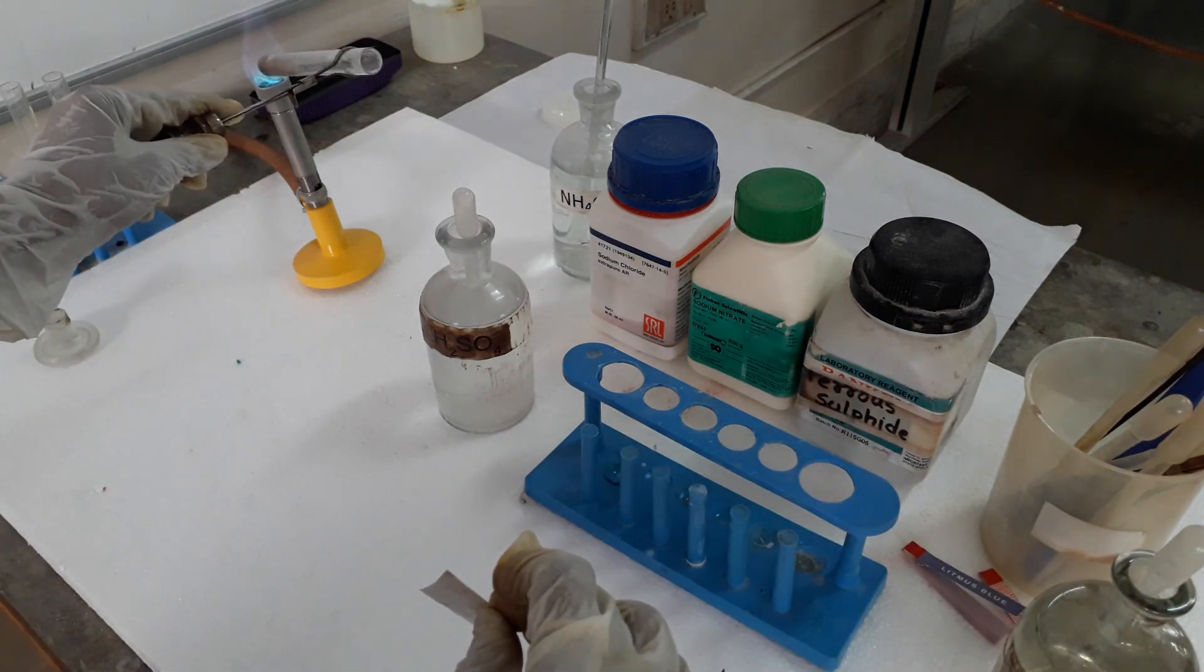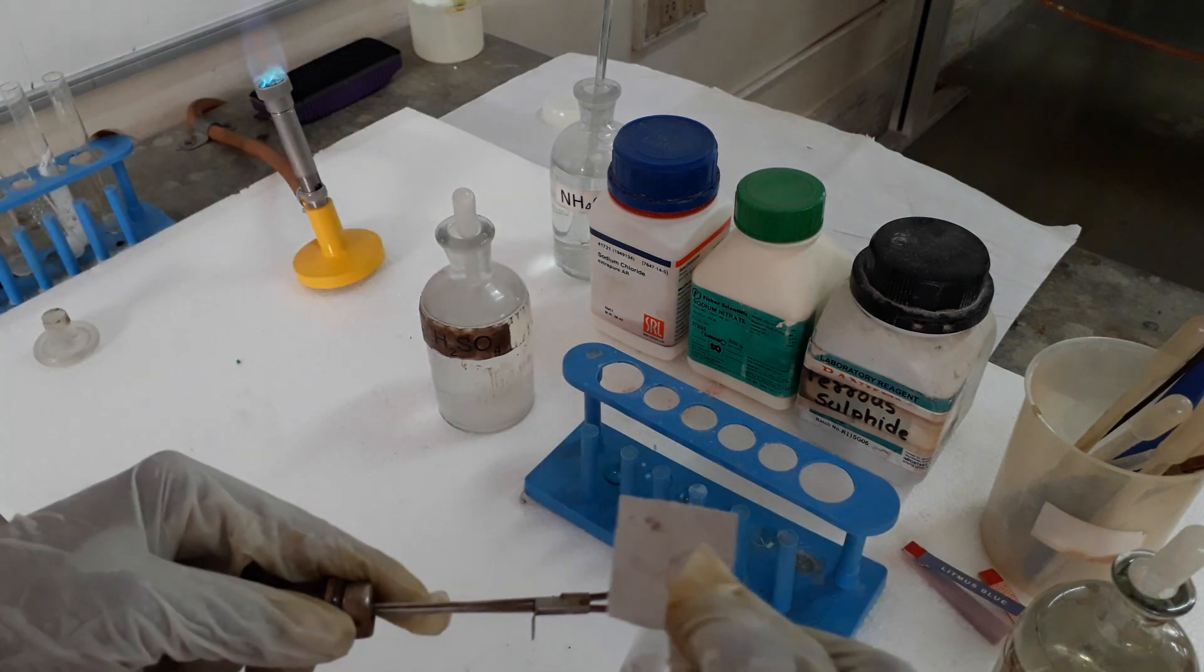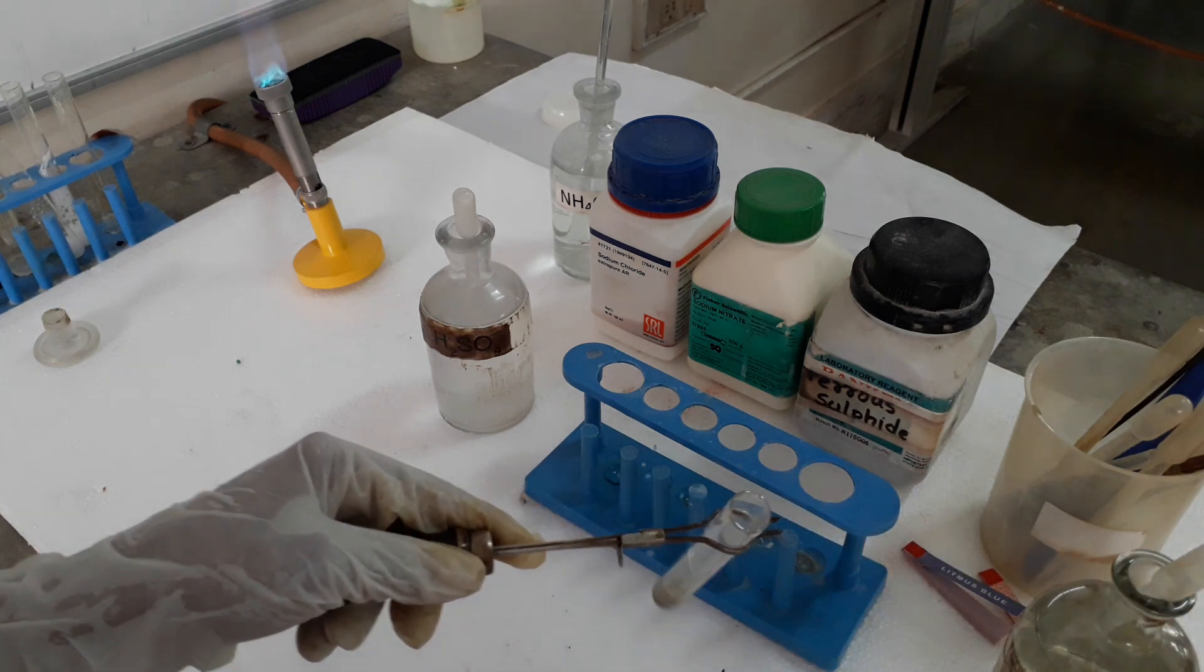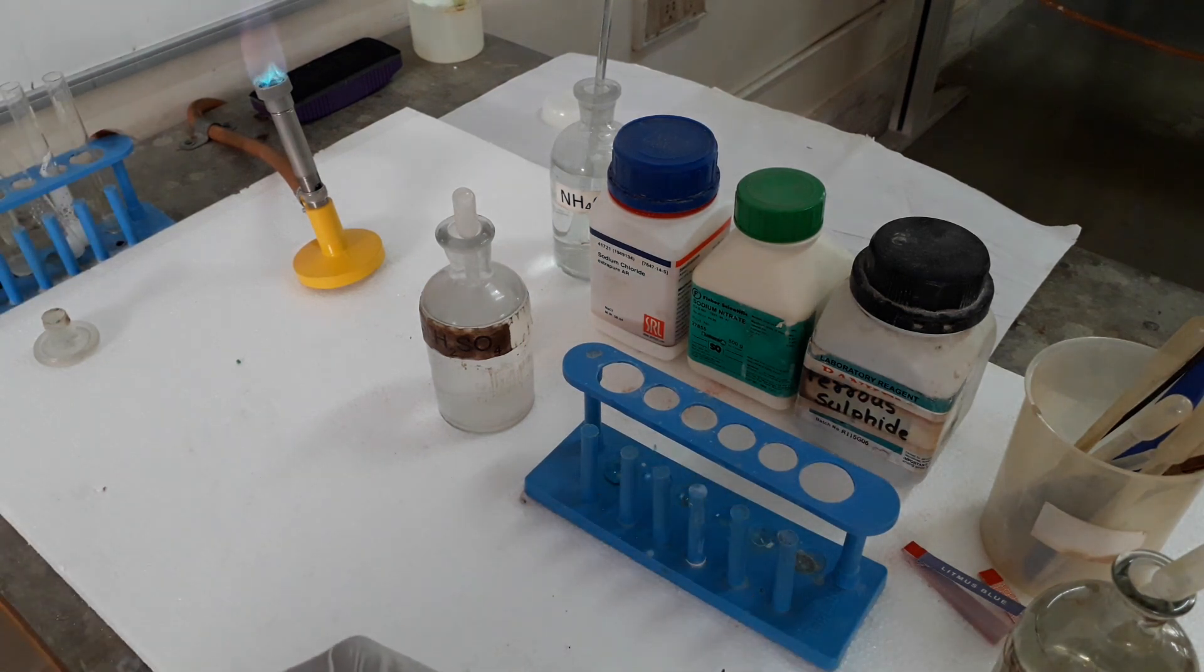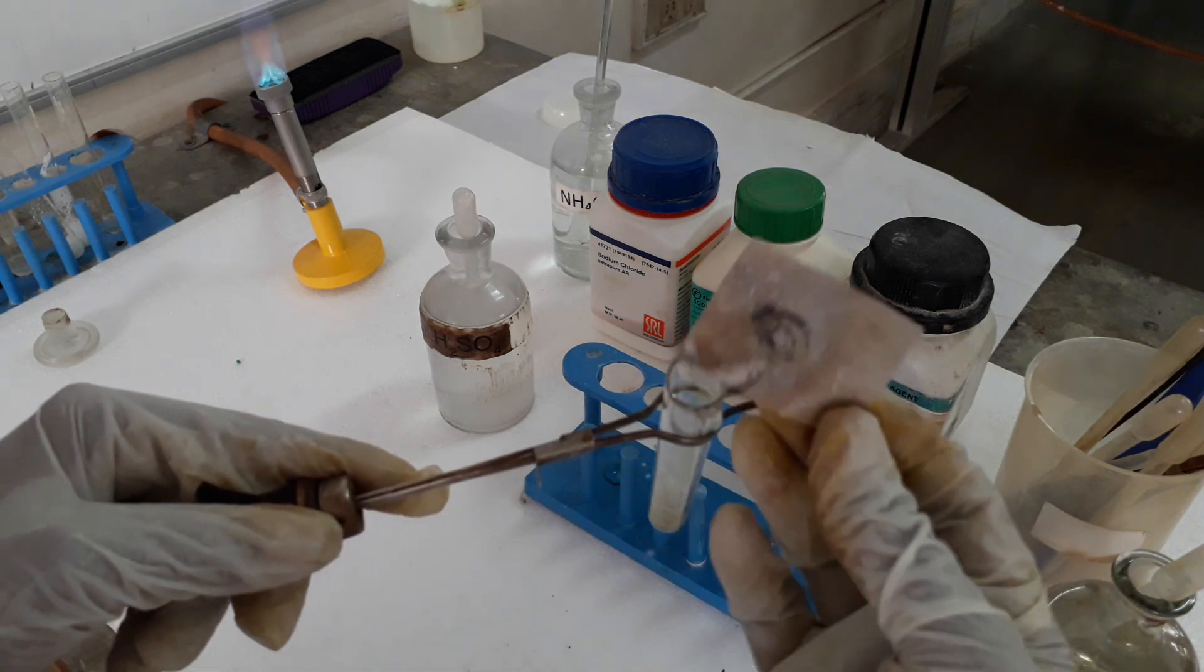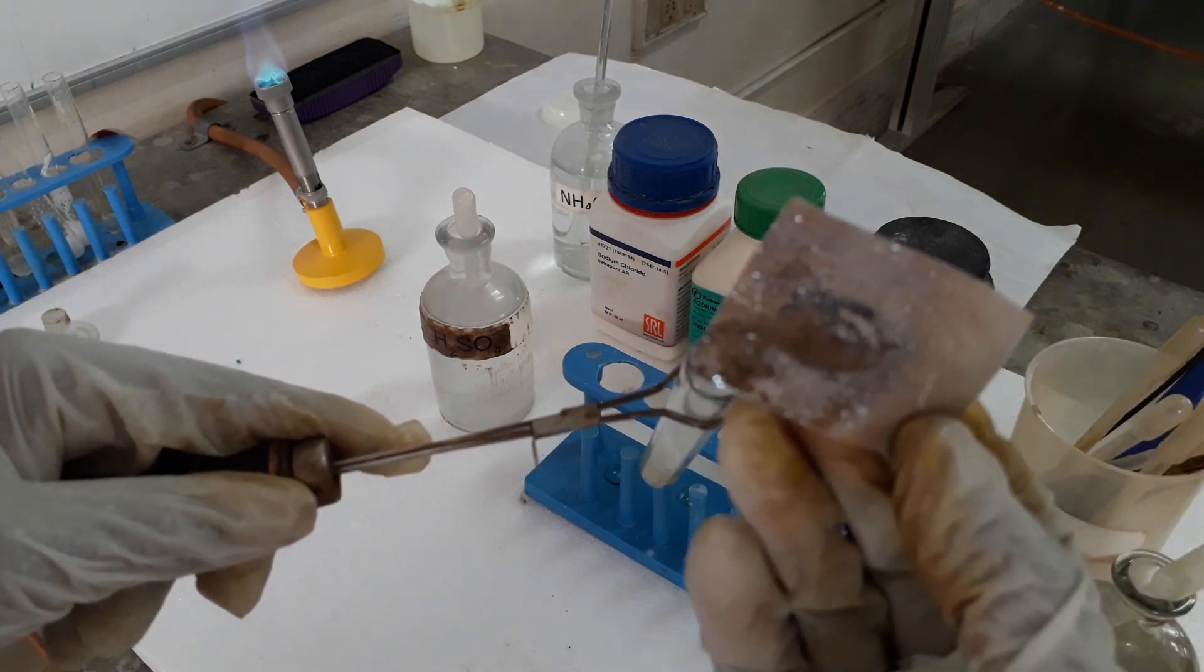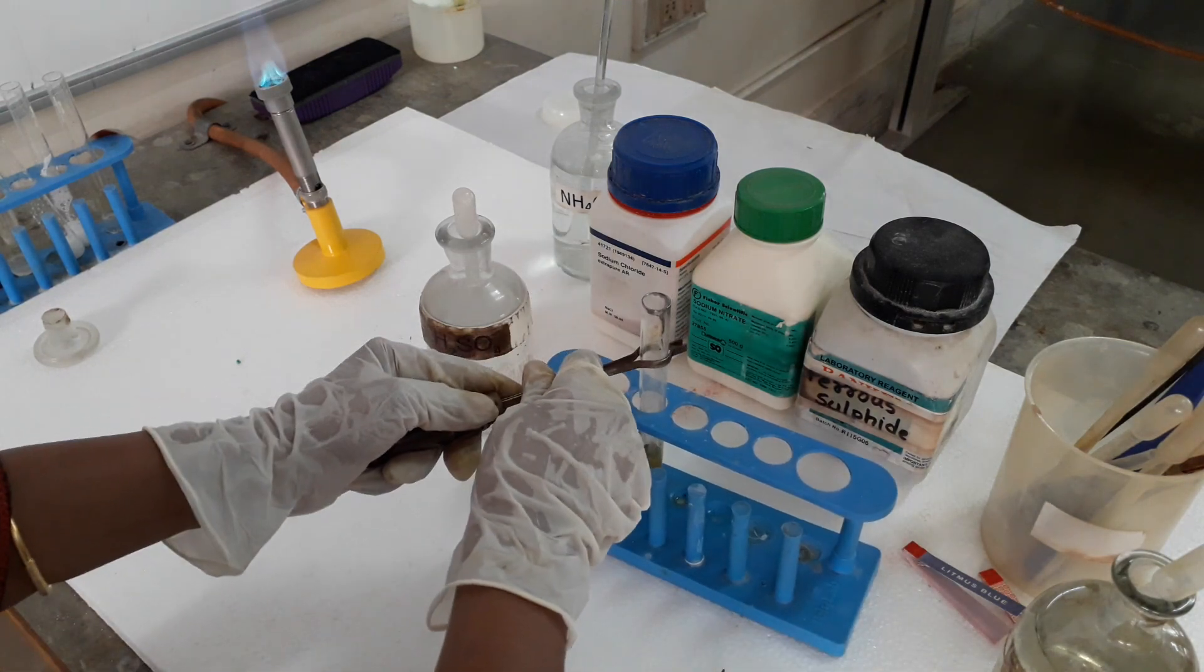Little more we will heat. Lead acetate paper will turn silvery black. See, it has turned completely—this is called silvery black. The gas which is coming out has a rotten egg smell and is turning the paper silvery black. This confirms that the salt has sulfide as anion, S2 minus.